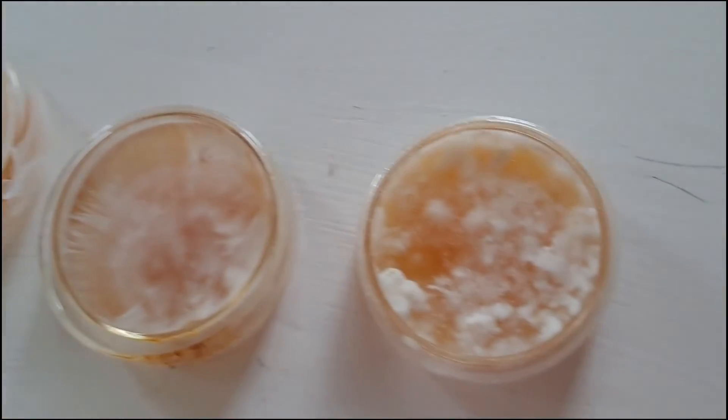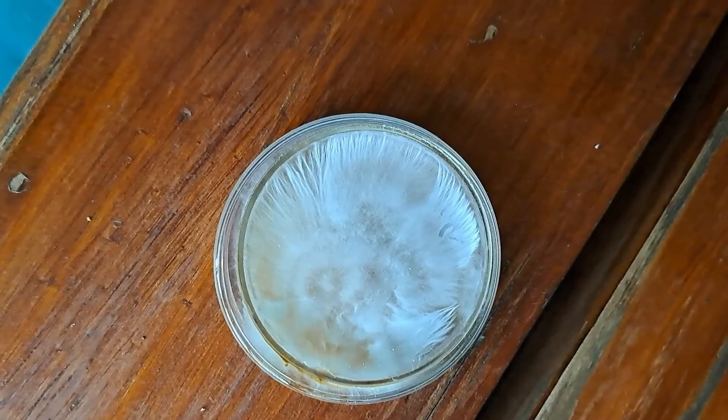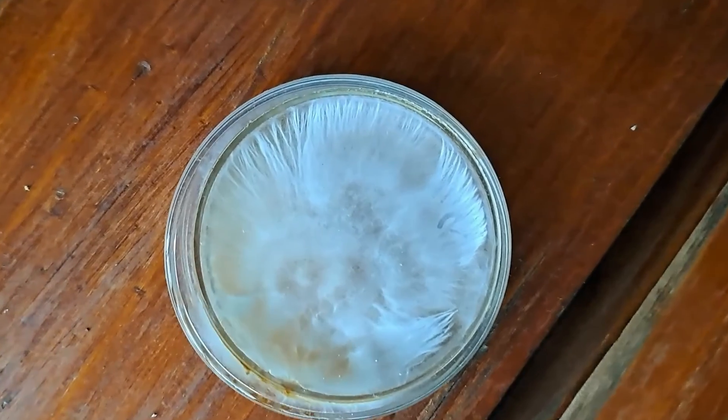I want to give another tip: when doing agar-to-agar transfers, always start with the best mother dish because you want the highest chance of success, then move down the line to the worst. I started with my best one — the one that had the most rhizomorphic growth — and did as many transfers from that as I could before moving on to the other ones.